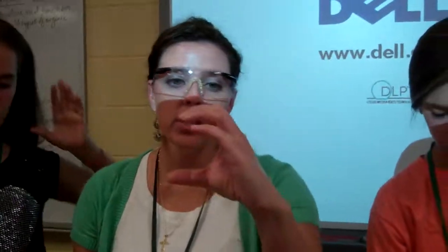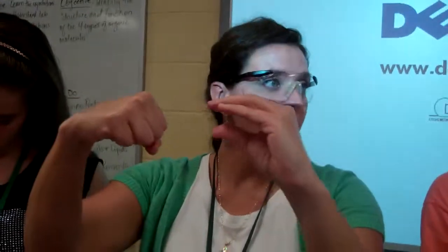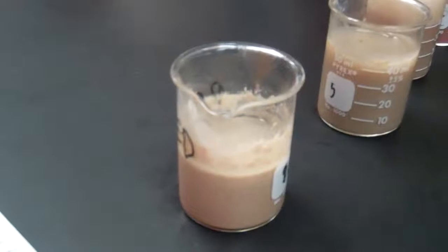So when I added the acid to the liver, what did it do to the enzyme? It denatured it. So if this is your liver enzyme and this is your hydrogen peroxide, it should interact and then change into product. But what happened to this when I added acid? It shriveled up. It changed shape. And so can this interact anymore? No. All right, what about the boiled one? All the enzymes are boiled away. So same thing. Denatured.